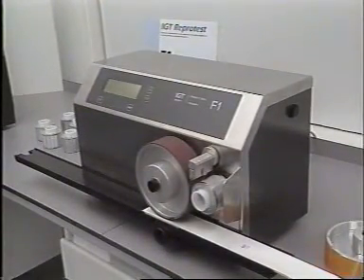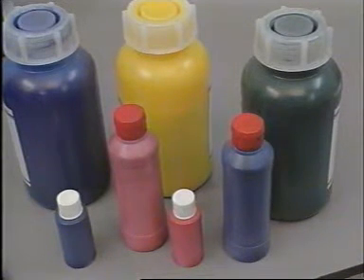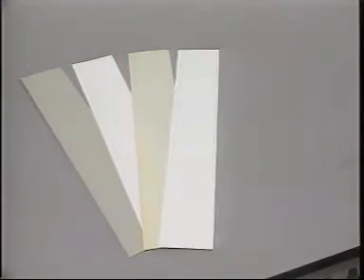Abrasion resistance, adhesion and flexibility of the ink on all sorts of substrate, ranging from paper to plastic film.